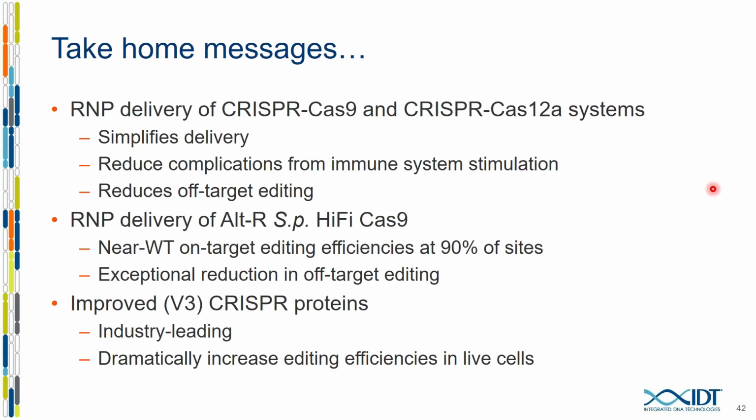Axel would like to know if you could provide any advice on how to optimize the Cas9 complex for HDR rather than non-homologous end joining. Yeah, so Ashley, do you know if we have the app note online yet for HDR? We do. So Chris is referencing an app note that you can access on our support link on our website that's going to provide some basic information for delivering a short single-stranded oligo, which is an ultramer for HDR that shows high activity with RNP.